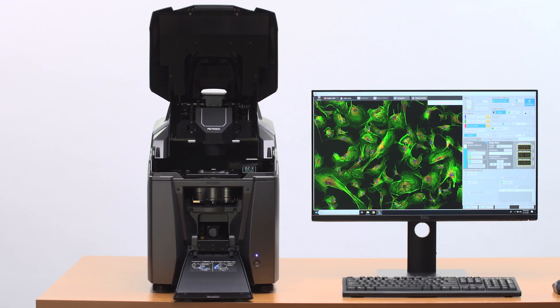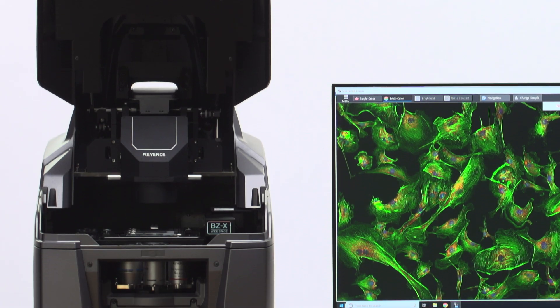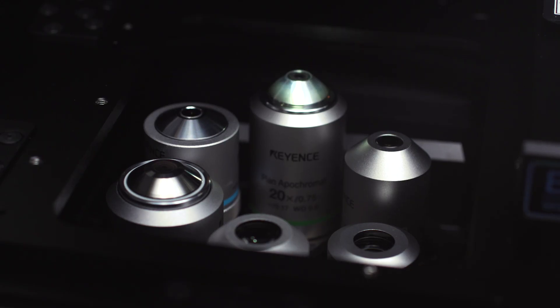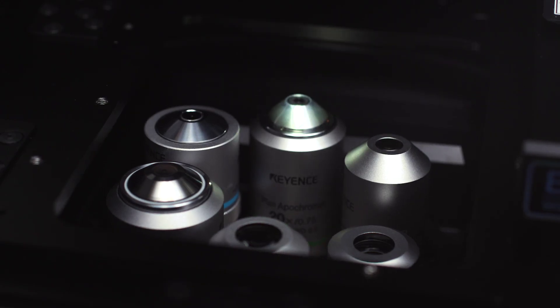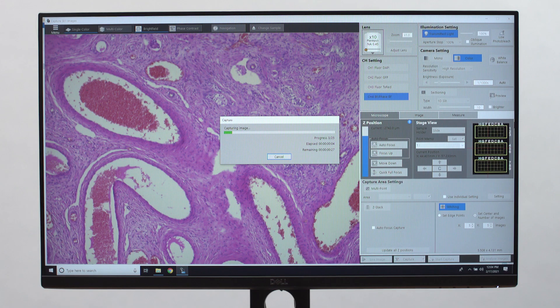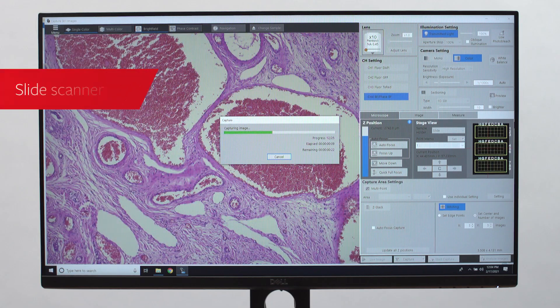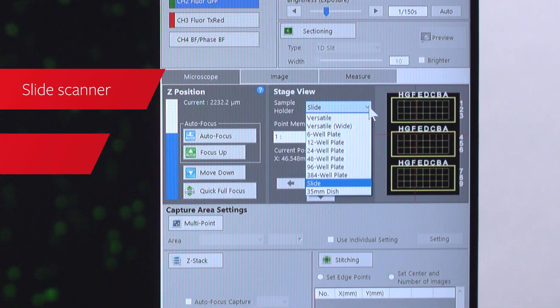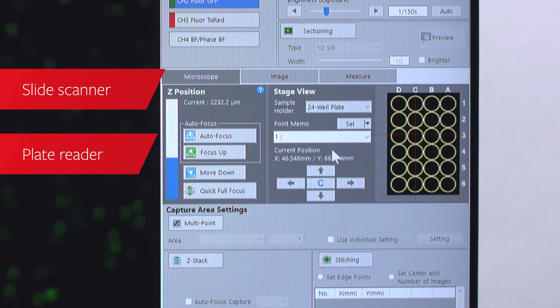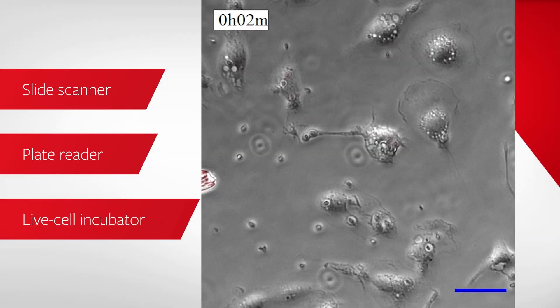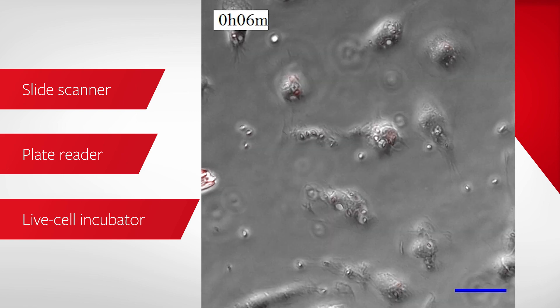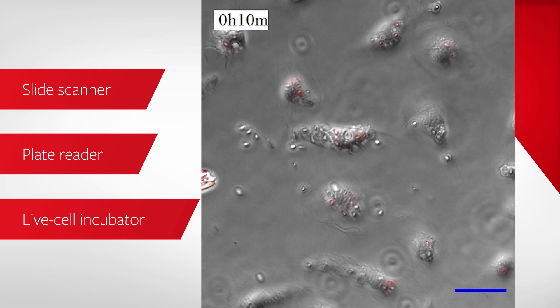The BZ-X pushes beyond the capabilities of the traditional epifluorescence microscope, streamlining the capabilities of a slide scanner, plate reader, and live cell incubator into a single platform.